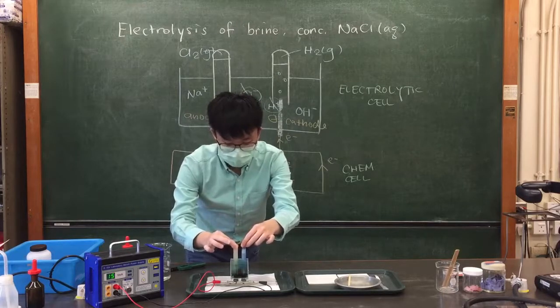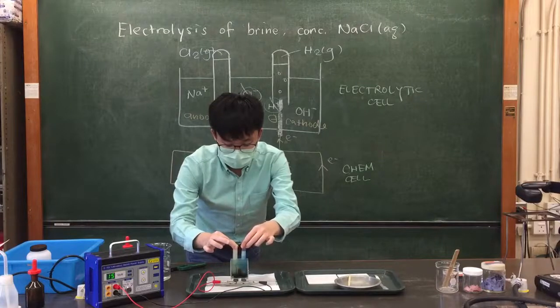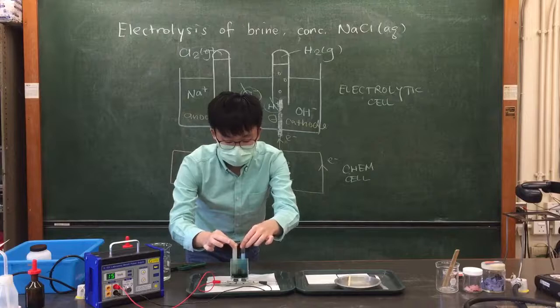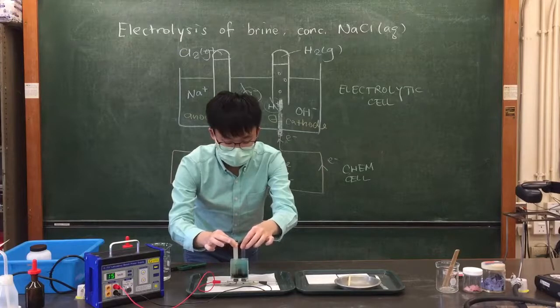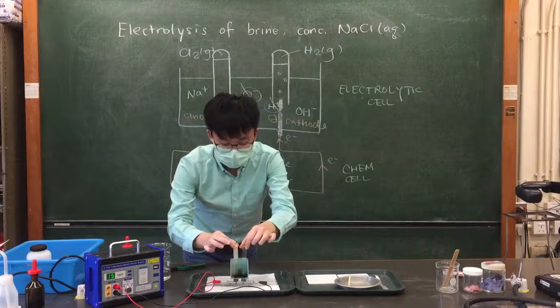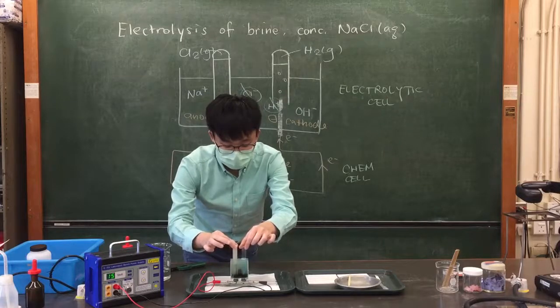And of course, the gas collected on the left hand side is quite slow, although theoretically speaking, it should be of 1:1 mole ratio. And according to Avogadro's law, they should be of the same molar volume. But the problem is, chlorine is slightly soluble in water, so it is quite slow actually. And on the right hand side, hydrogen is quite good. You can actually see those solutions start spilling out because of displacement of water. The water inside the test tube has been pumped out already.